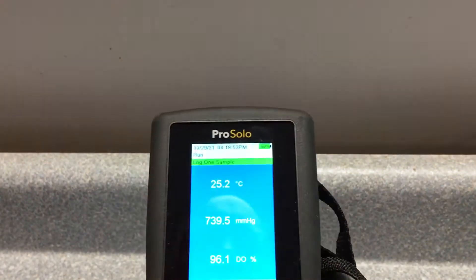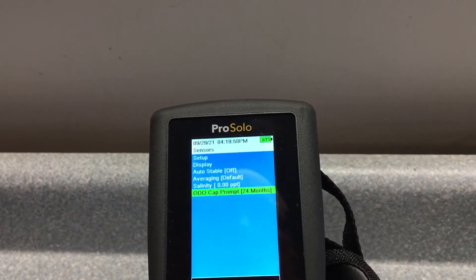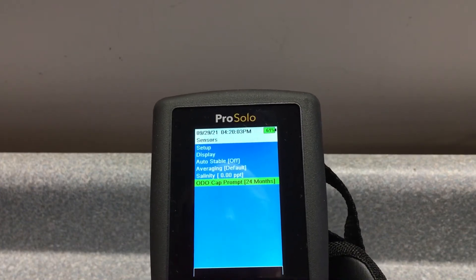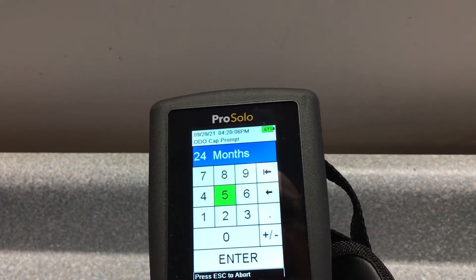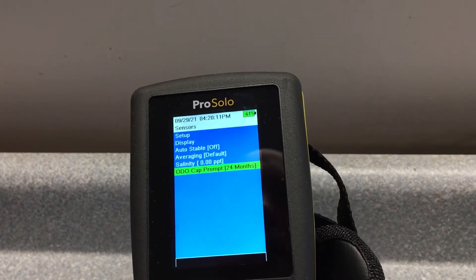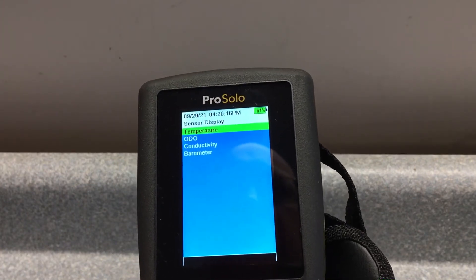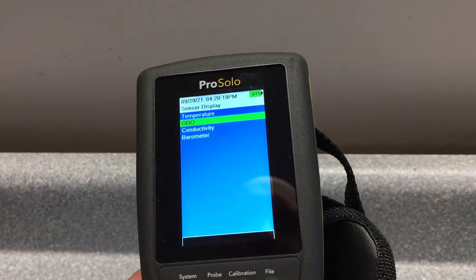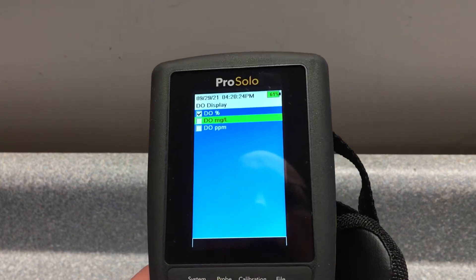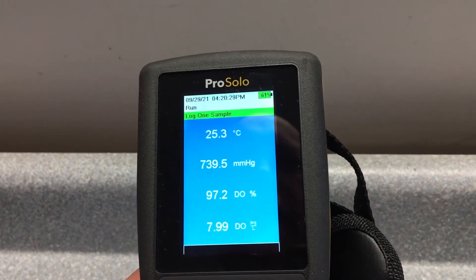When we look at the probe button, the first thing is it has the ODO cap prompt — you can set that. We typically keep that at two years. You can go back in and change the display settings and the temperature units, and you can look at the ODO. You can set percent or milligrams per liter. We'll check that and then hit escape out of that menu.